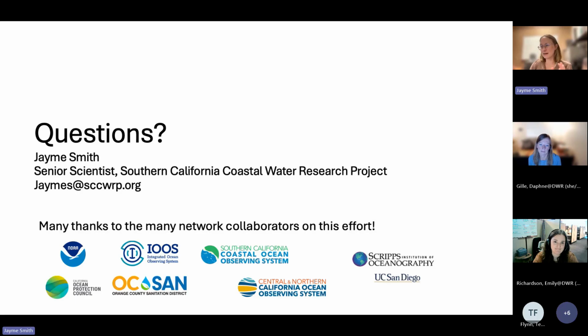There are programs where you can click, and it takes some of the work out of classifying, because they essentially have a program that helps you classify by showing you a couple of images at a time. So you wouldn't be starting literally from zero. You could leverage some of that, but depending on your system, there might need to be some image library building for freshwater.